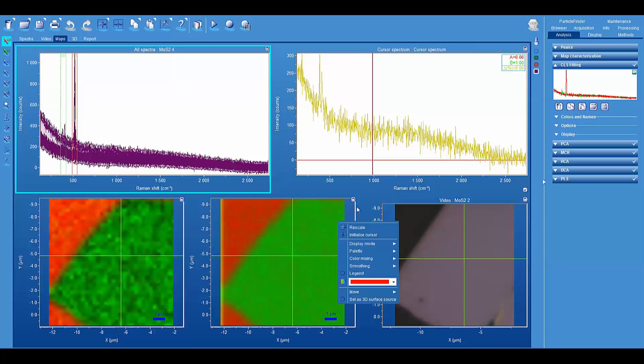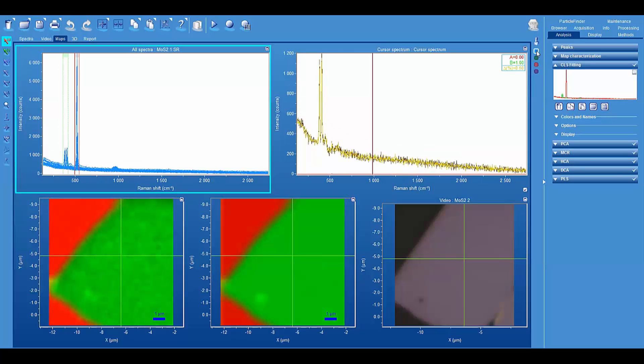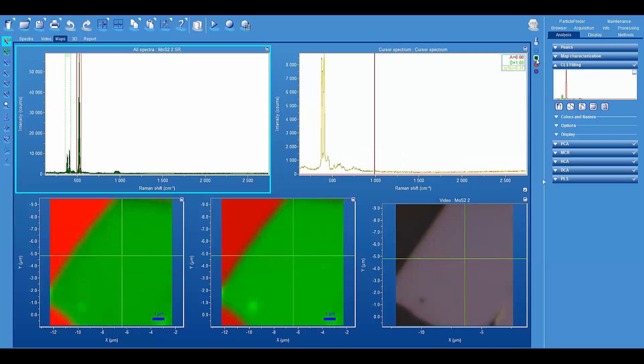So here's 10 milliseconds per point, 50 milliseconds per point, 100 milliseconds per point, and one second per point. I hope by going through this demonstration here, you could see the importance of the chemical contrast and as manifest in the different spectra and how, if one has that, then the opportunities for fast Raman imaging are indeed great.